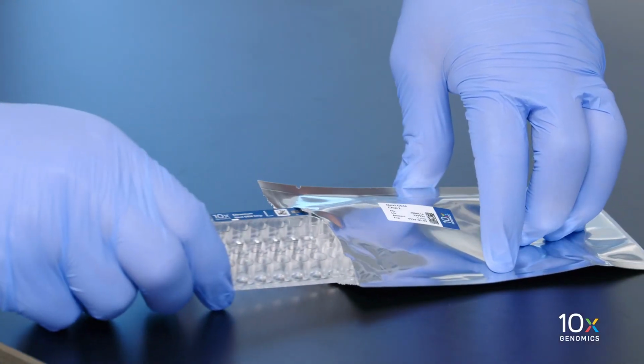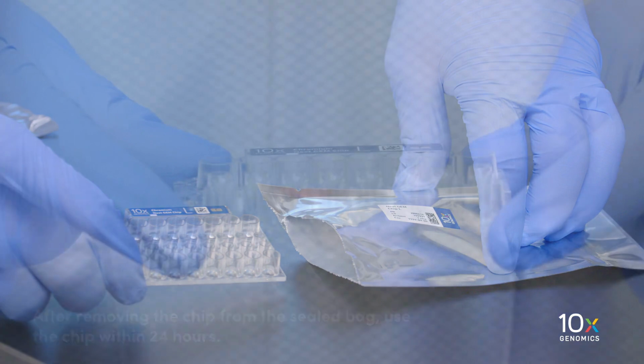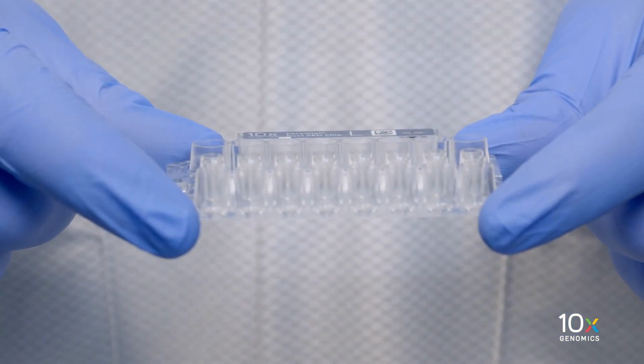Remove the chip from the sealed bag. After removing the chip from the sealed bag, use the chip within 24 hours. We will hold the chip by the edges, making sure not to touch the bottom of the chip.